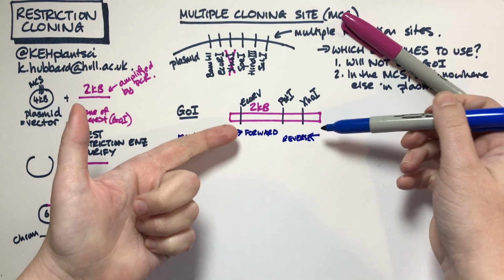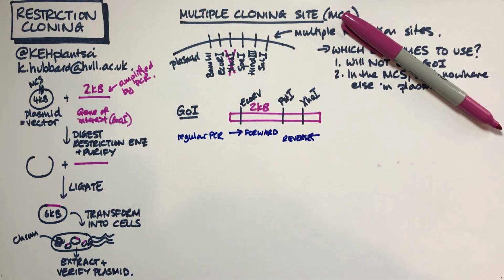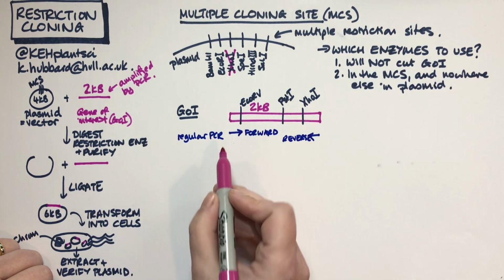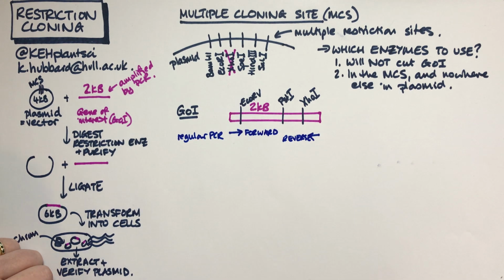They would copy your gene of interest. You then put them through the thermocycler and you extract them on the gel. So with your regular PCR, you just have something that's complementary to your gene of interest. The primer would start at the start of your gene of interest, end at the end of it, and that will be good enough.